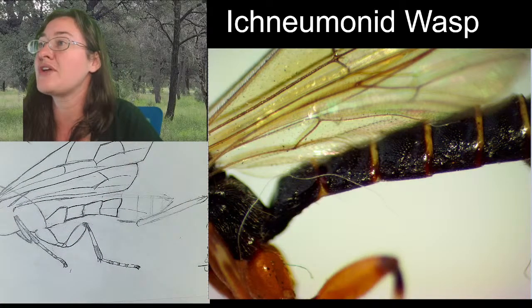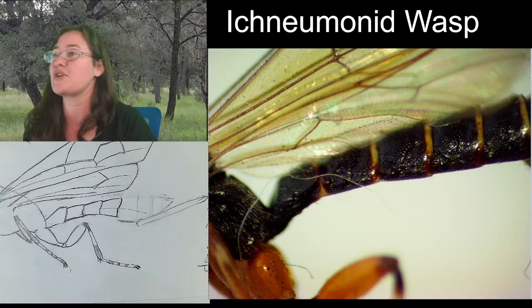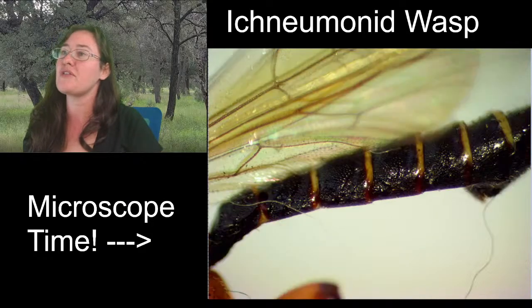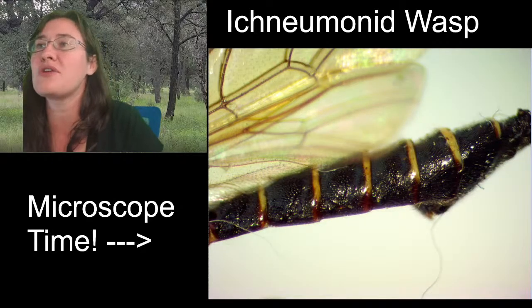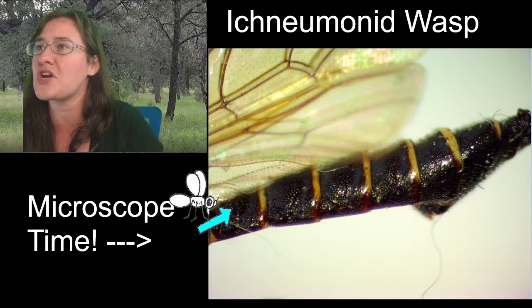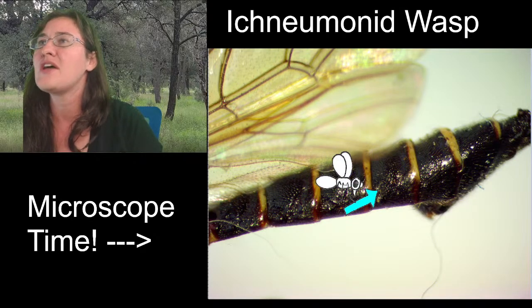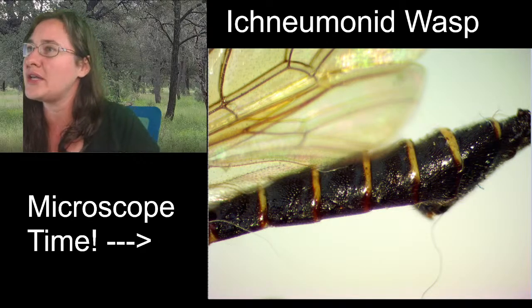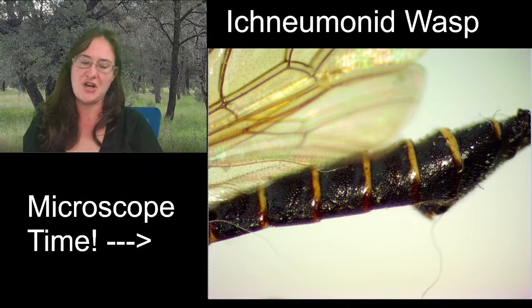One, two, three, four. The next one is 5. And 5 is the last one that we can see on our screen. So I'm going to be moving this over a little bit. All right. So now we can see this one starting here is 2. 2, 3, 4. This one is 5. 5 is the last one before the weird ovipositor starts, I believe.